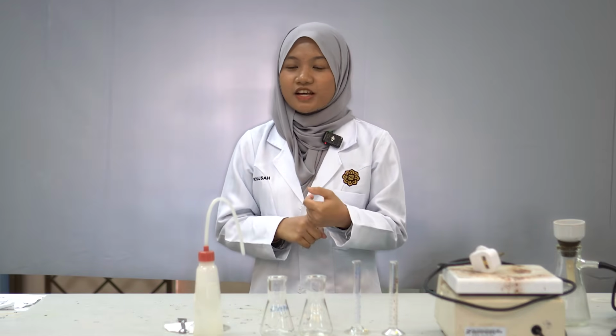Now, the problem for this experiment is that almost all organic solids have impurities. So to fix it, we will use recrystallization to remove the impurities and get pure crystals.